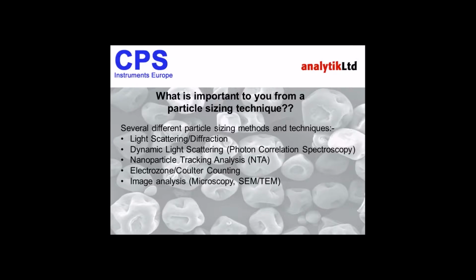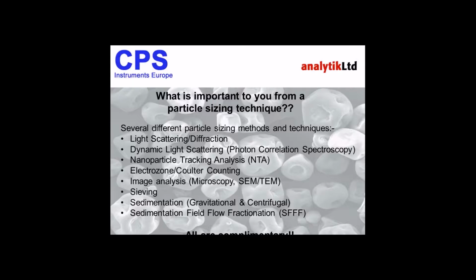Followed by, we have here counting and imaging techniques. And then further down here, we have various separation techniques. So I think at the end of the day, all of these techniques are complementary and they have to be used together to give a complete, true picture for your particles. I'm not going to say one is better than the other. My objective of this webinar is to focus on centrifugal sedimentation only and highlight its key features and benefits, and also talk about some of its drawbacks.